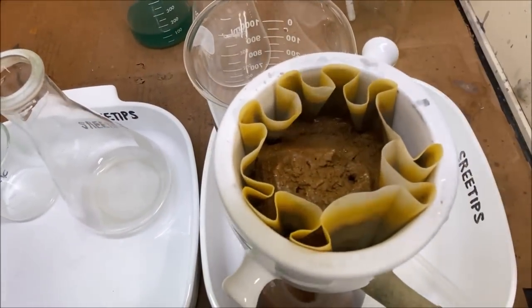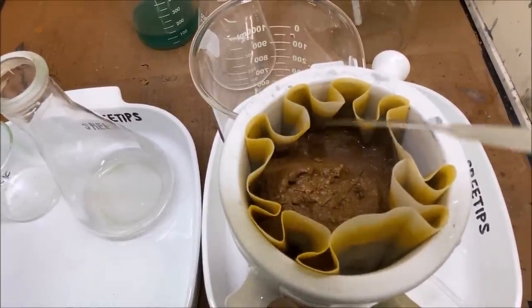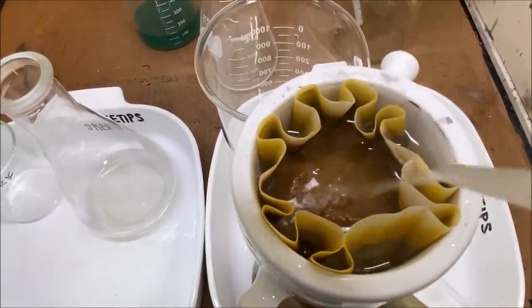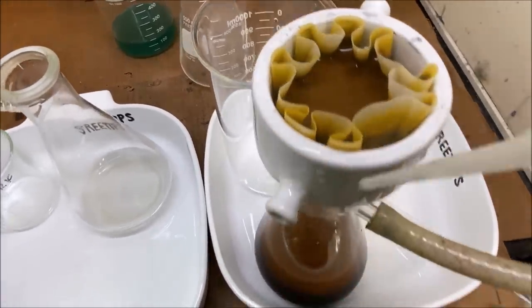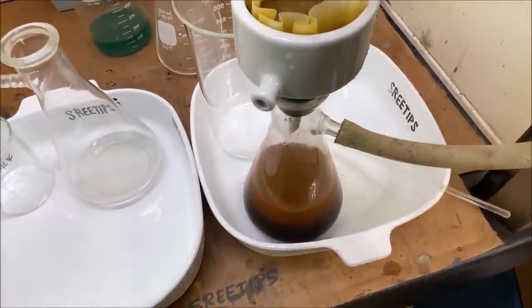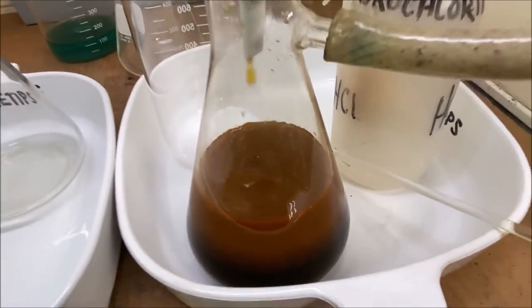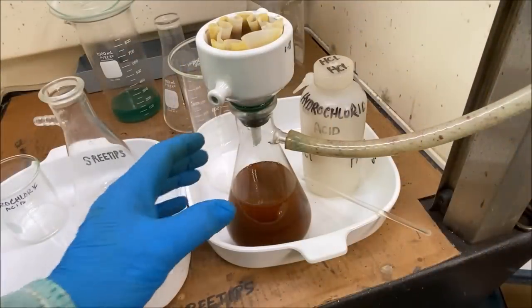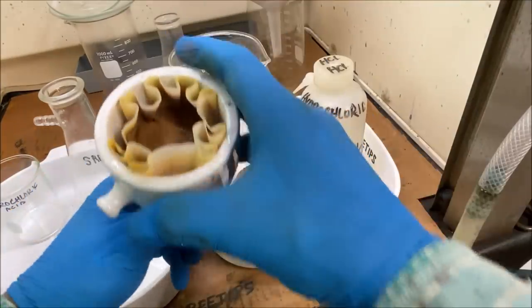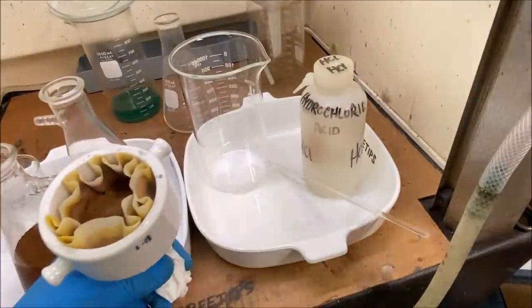It's all gold. Wow. There's quite a bit of material in here. If this is all gold, that's going to be a decent amount. Using hydrochloric acid to rinse it. And we got something forming down here in the filtrate. Not sure what that is. I've got the gold filtered out now in this funnel. There's our filtrate. Got a bunch of junk in it. We'll have to deal with that later.